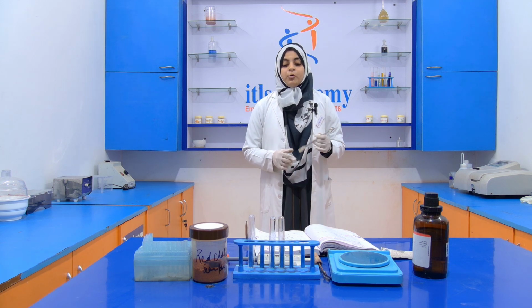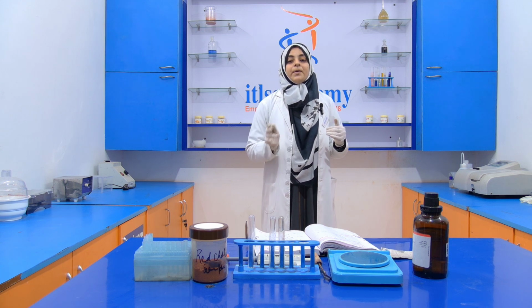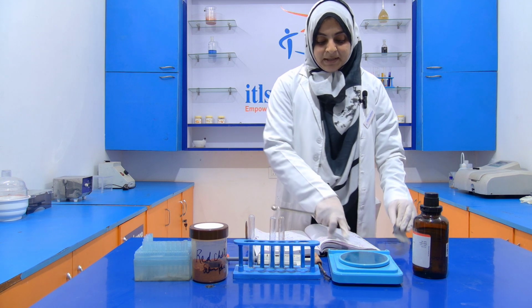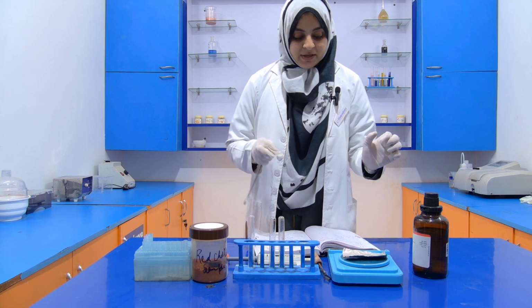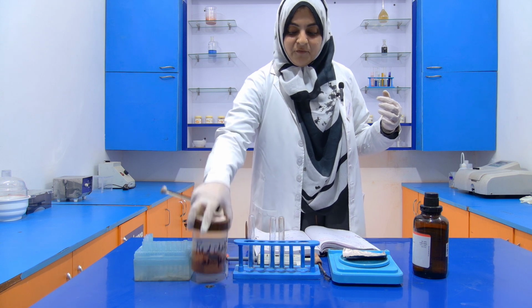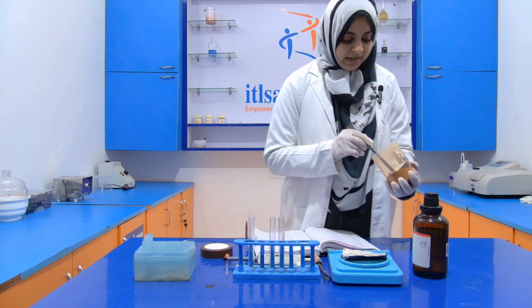If rhodamine B is present in the red chili powder, then it turns red in color, which indicates the presence of rhodamine B. Now let's start the experiment. First of all, switch on the weighing balance and put the aluminum foil on it. And don't forget to tare the weight of that aluminum foil. Now take the chili powder with the help of the spatula.